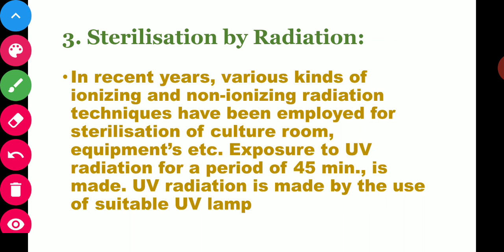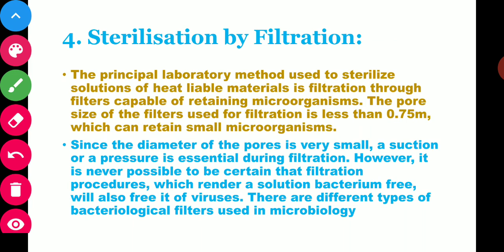Sterilization by filtration. The filtration technique is a very fine technique, principally used to sterilize solutions of heat labile material, and to remove all microorganisms present in those particular solutions, which are heat labile.